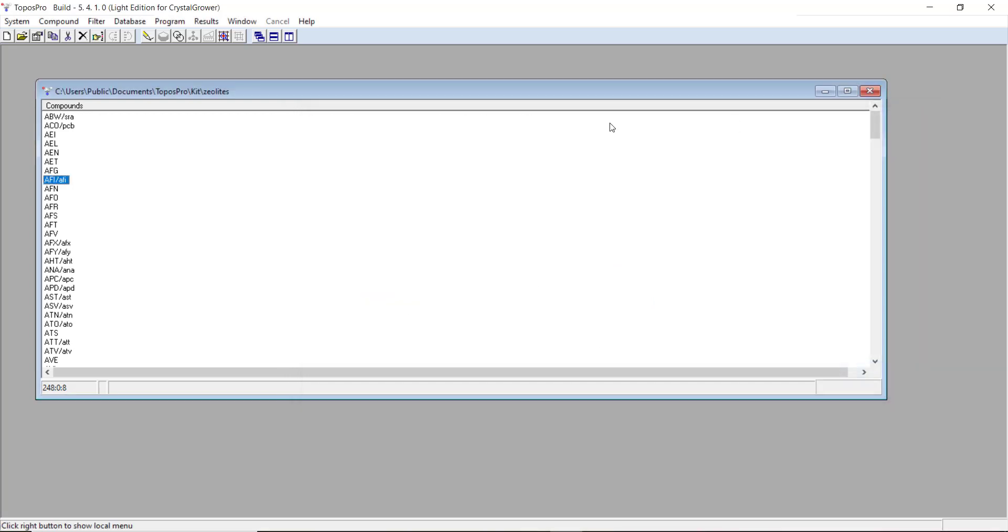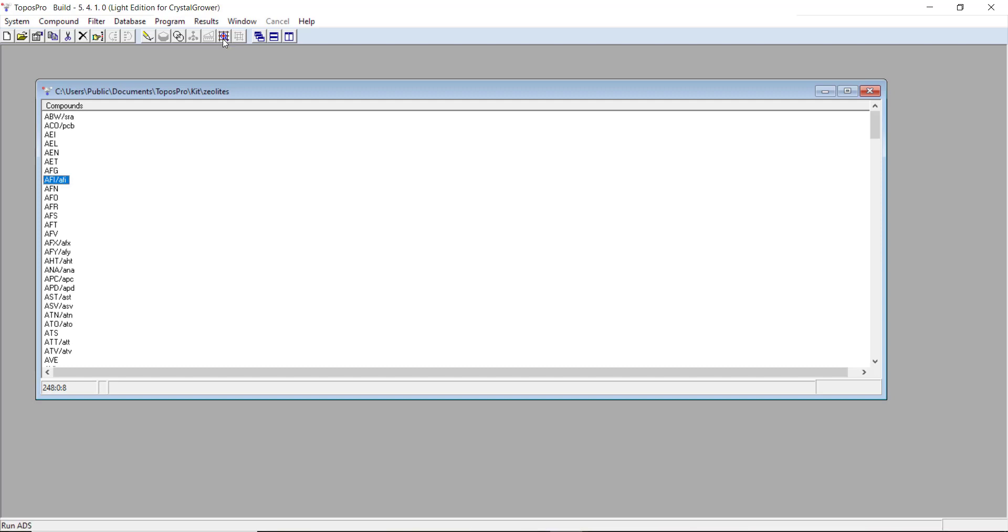Then the final stage will be using this module here, ADS, to actually calculate either your natural tiling or your simplified net, depending on what type of structure you're looking at. This will actually create a child database with your process structure in it. And from that database, you can output your structure file.